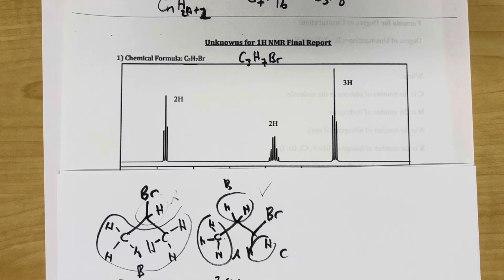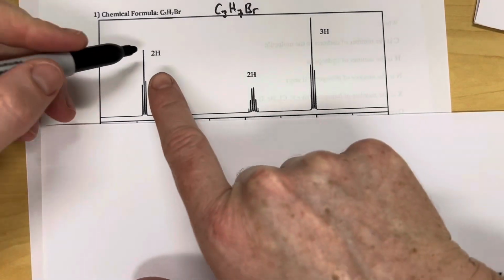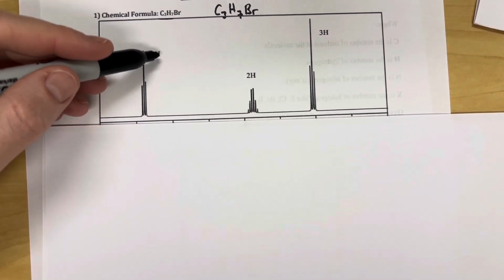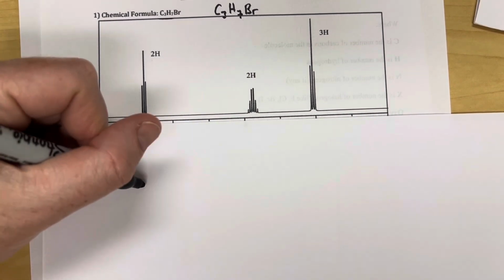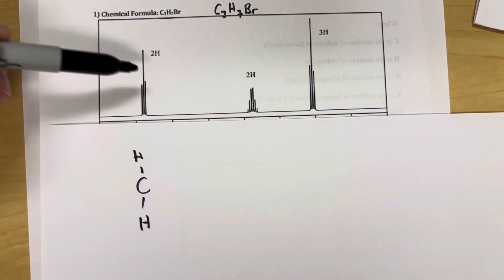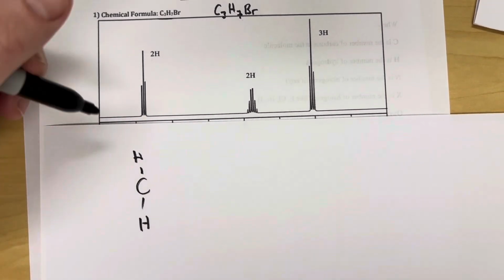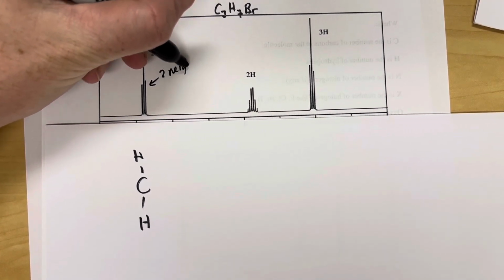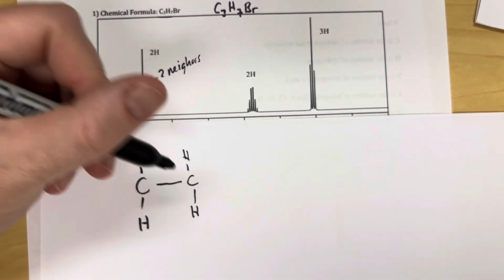All right, so I'll get a piece of paper here. Let's do this. Okay, so this thing, this 2H, this would be the integral, essentially saying something that has 2 hydrogens. So this is something with 2 hydrogens and it's a triplet. What that means is that it's most likely a carbon with 2 hydrogens, and the fact that it's a triplet tells you that its neighbors had 2 things on it. Remember, N+1 rule, this must have 2 neighbors. So what that tells you is it's probably a carbon attached to two hydrogens like this.